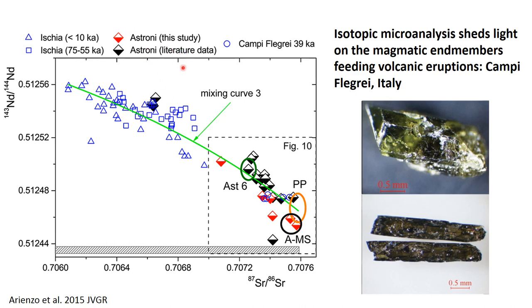Okay, and you can see that we do get a spread of values that have different isotope ratios. But to see the differences between maybe one source and another, between maybe these black points and these red points, we do need to be able to see very small differences in isotope ratio. Thermal ionization is very good for this because it provides a very stable source, so our ion beam is not fluctuating in intensity up and down. That enables us to measure very, very precise isotope ratios. And again, we'll come across this in more detail in the data processing video.